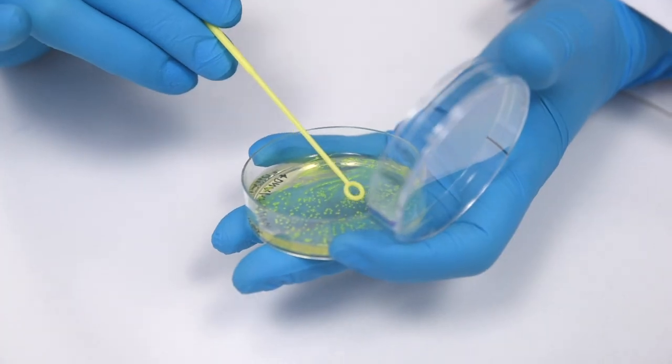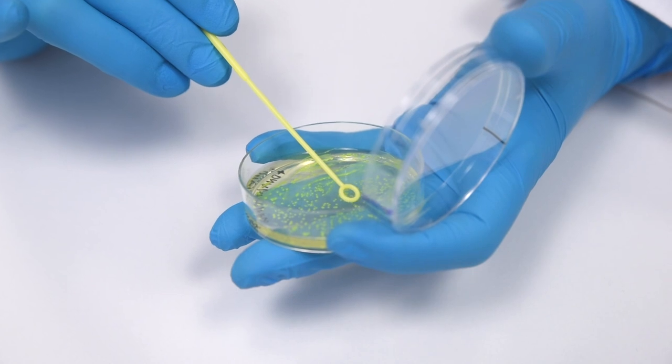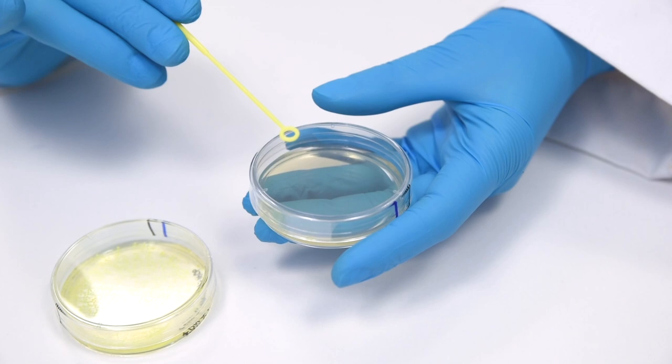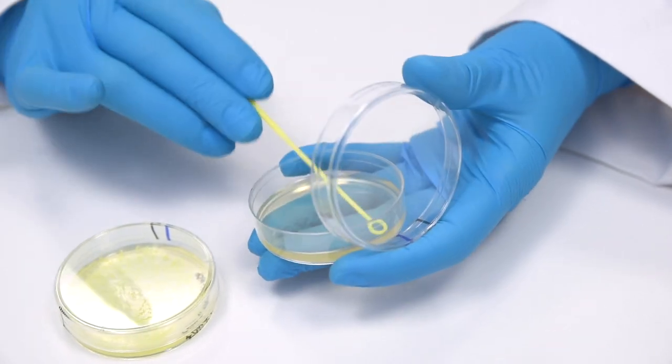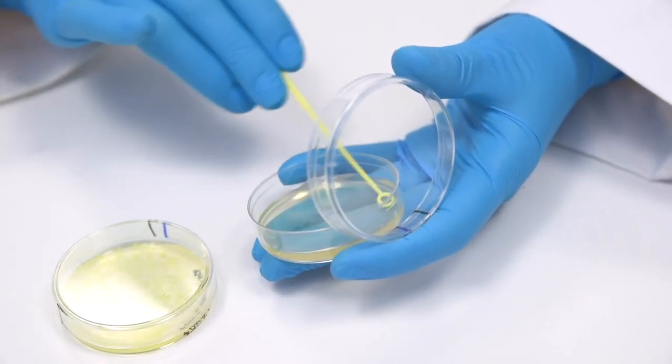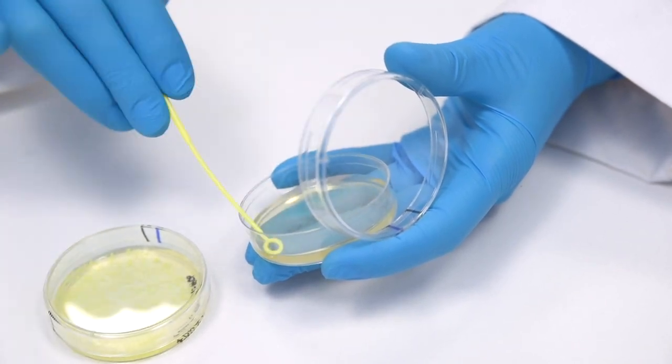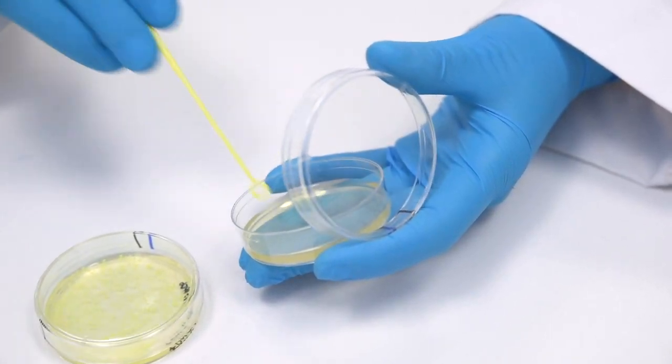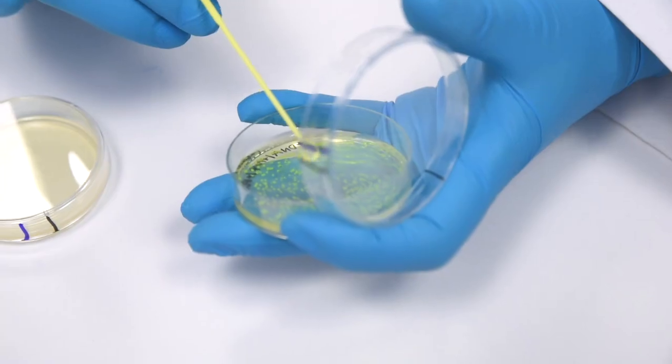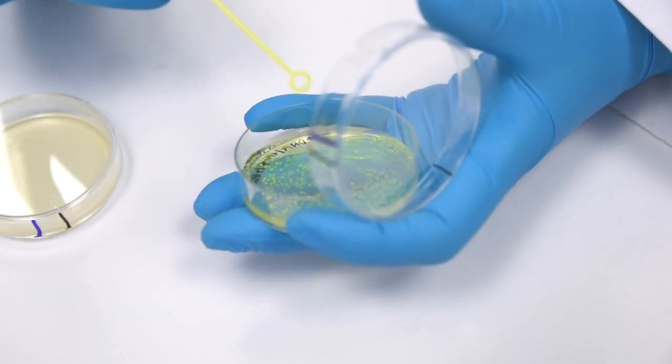Step 3: With an inoculating loop, pick 4 to 5 isolated GFP expressing or glowing colonies. Step 4: Spread the cells evenly and thoroughly over the entire surface. Turn the plate 90 degrees and thoroughly spread again using the same loop. Step 5: Repeat steps 3 to 4 for the second plate.